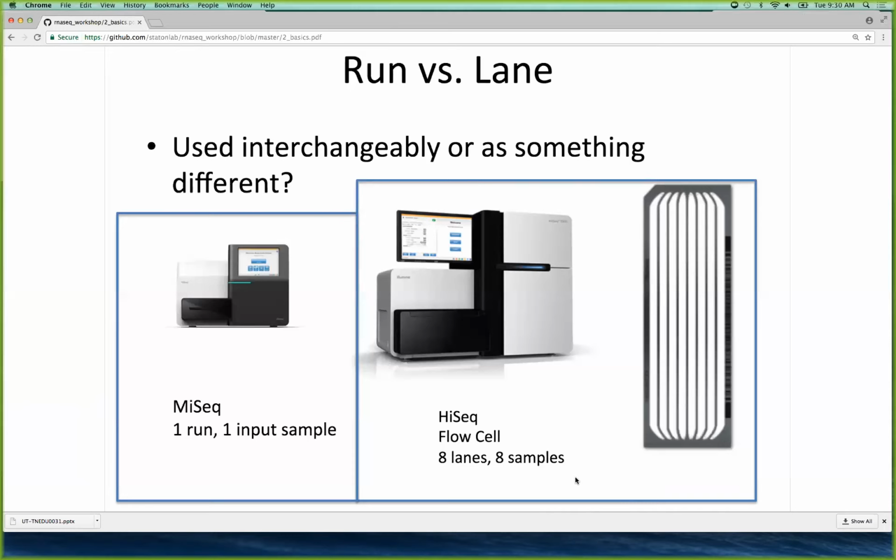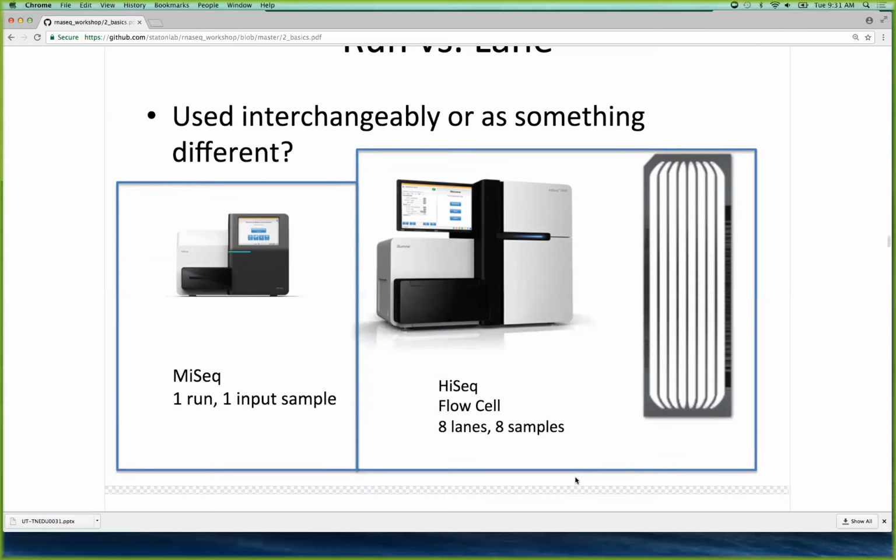There's a price point for each step. The more you want them to do, the more you pay. And that's another reason that the UT Austin wiki with all their prices is really nice, because they break down, like, we'll do your sample QC, we'll do your ribo removal or your mRNA selection, we'll do your library, so you can see what each piece costs and make decisions based on that. Any other questions?